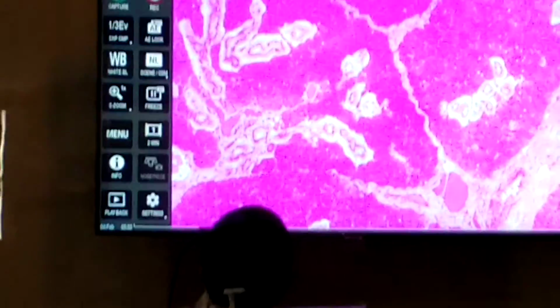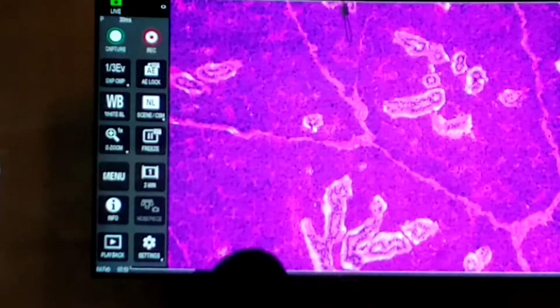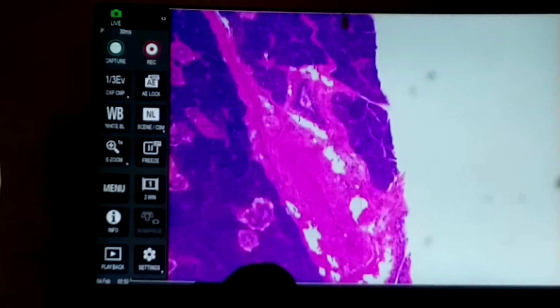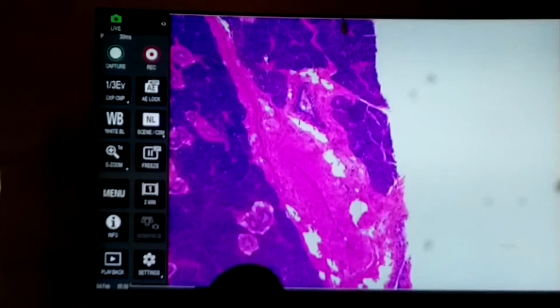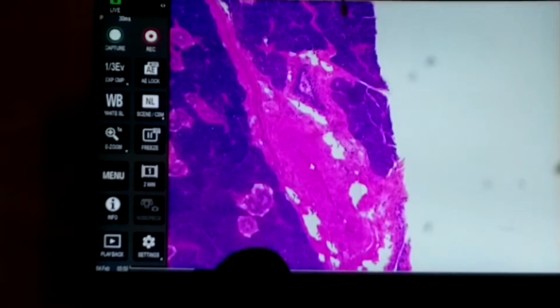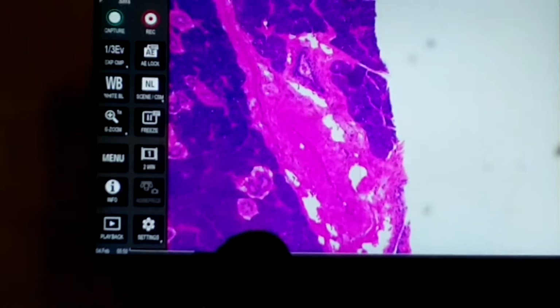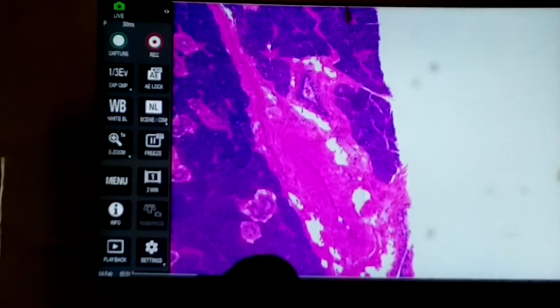Now, those smaller ducts will eventually empty into larger ducts. So if you look around the tissue some, you may find some larger ducts that represent the anastomosis. Like, for instance, here's a larger duct here. On the other hand, this right here is a blood vessel. It's elongated. This is a longitudinal view, but if you look at the lining, the simple squamous epithelium.